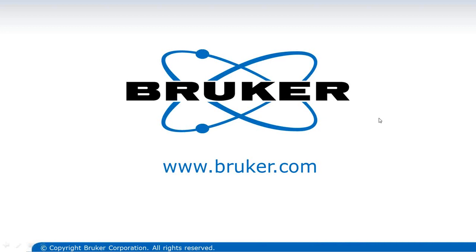That particular slide was made for a training presentation here by one of our software engineers. Most people, when they set up an Atlas acquisition, navigate around on the screen, as I showed on the navigation slide, and pick 2 or 3 different locations that, from their understanding of their sample, will define a rough boundary of the sample they want to acquire.